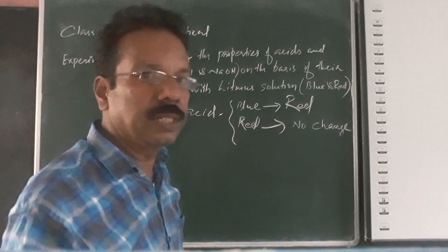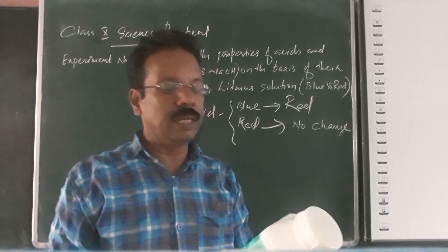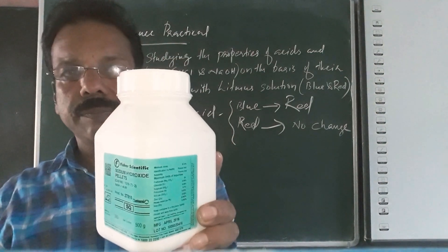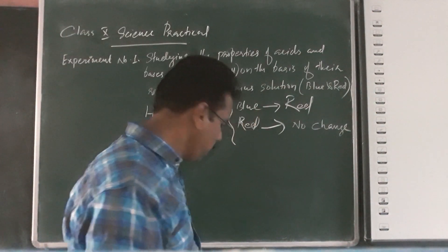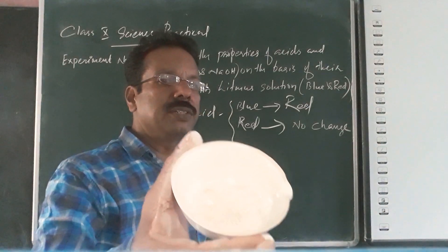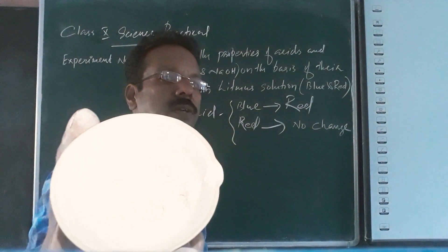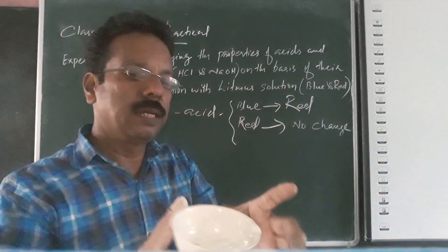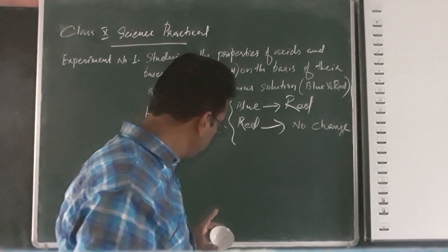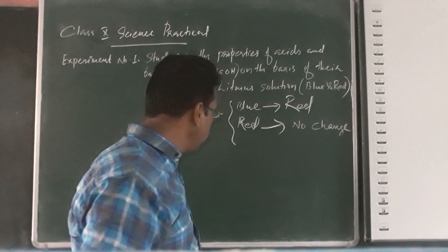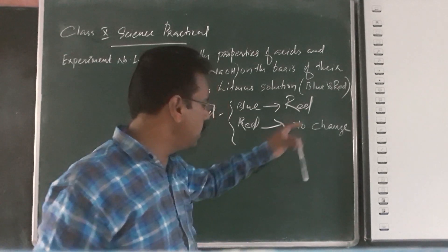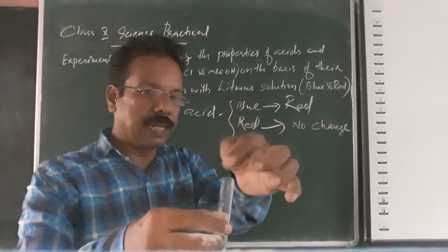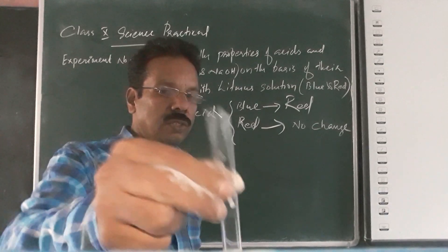Now we have sodium hydroxide. Sodium hydroxide is a base. Sodium hydroxide is taken in a china dish — can you see the sodium hydroxide pellets in it? It is highly corrosive; we cannot touch it with the hand. When taking the solution of sodium hydroxide, we put a few pellets in water to get a sodium hydroxide solution.